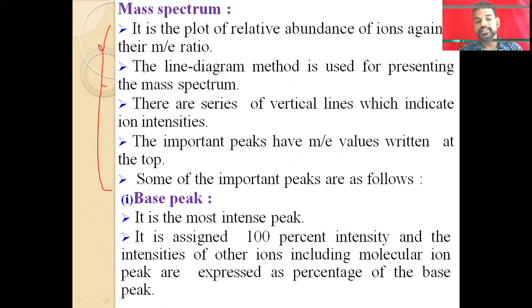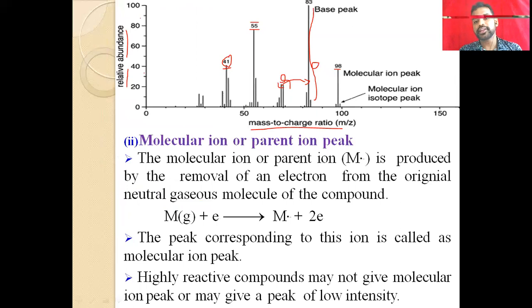So here, in some cases, the molecular ion peak or parent ion peak and the base peak are the same. In some of the cases, they are different. For example, the molecular ion or parent ion peak. So here you can see this is the molecular ion peak.